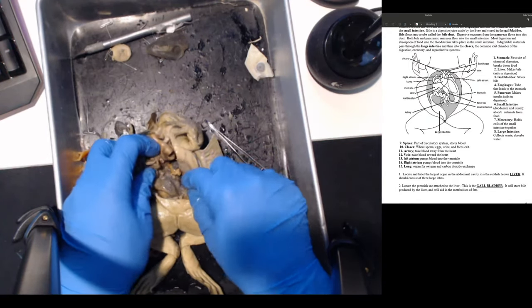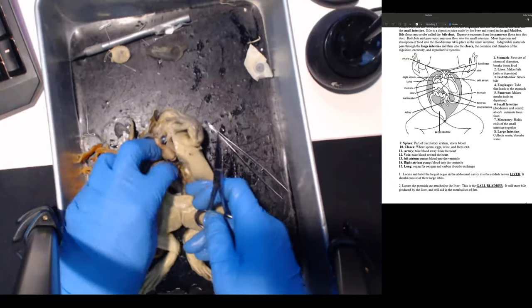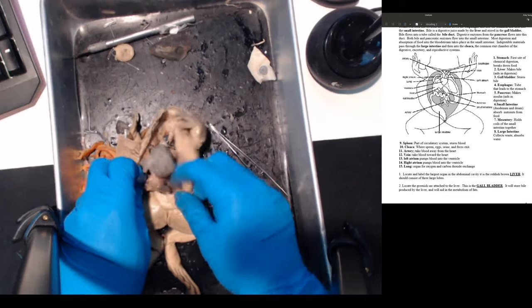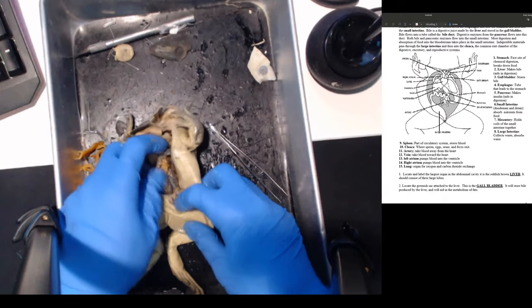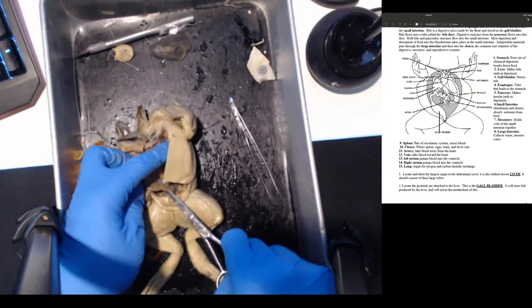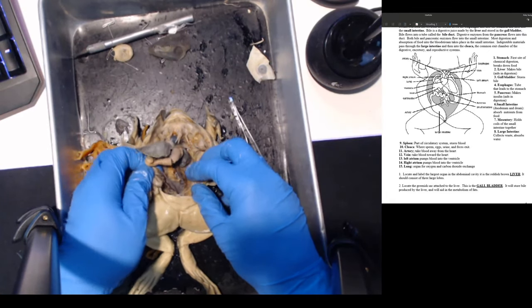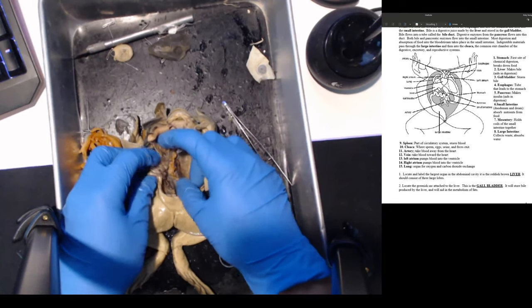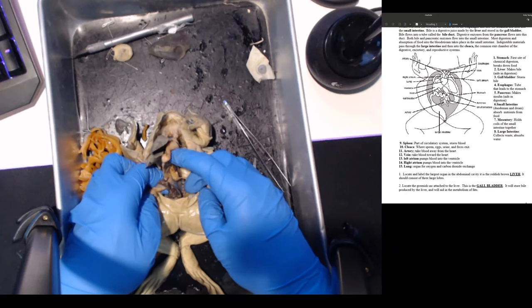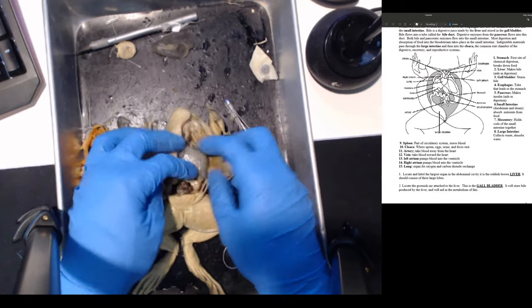I remember cutting a frog before where you could actually find insects inside the stomach. Let's cut the large intestine here at the back - it's going to go towards the anus. This is the large intestine and it looks pretty full. I'm going to cut this open - that's all the waste right here. That's your large intestine.